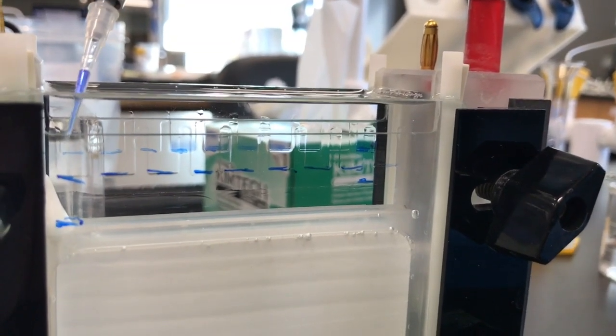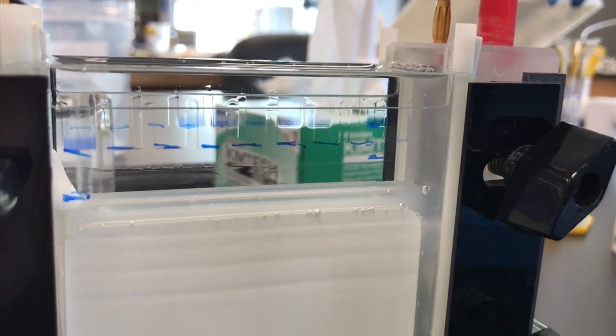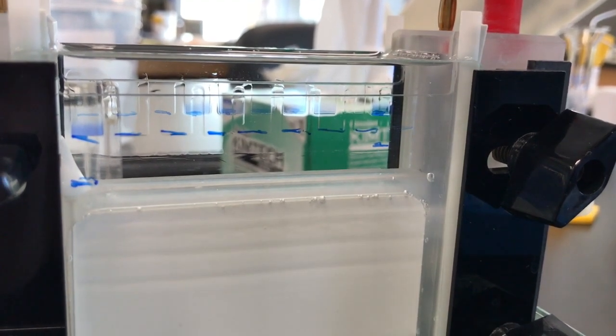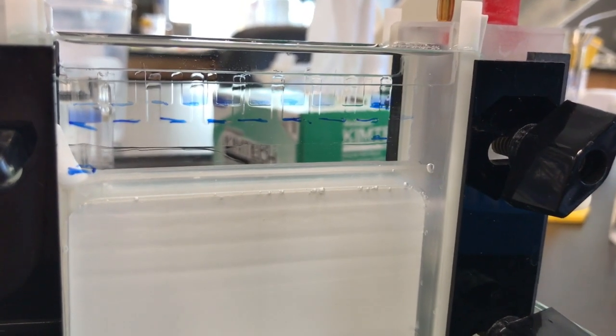Now, to load your samples, using a P10 pipette, you are going to pipette 10 microliters of sample into each well. You want to pipette it slowly so that the sample will naturally just fall down into the well.